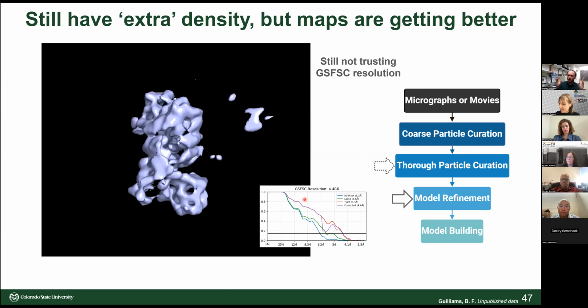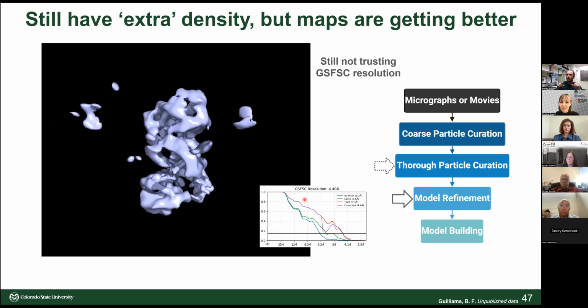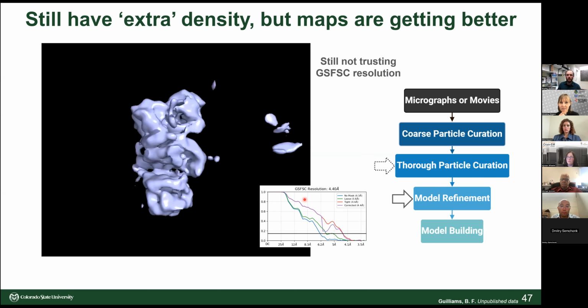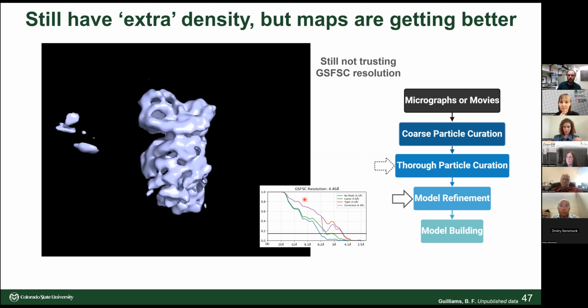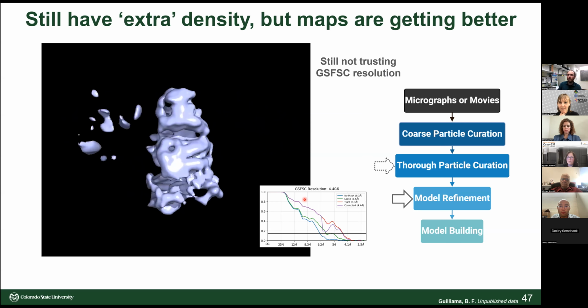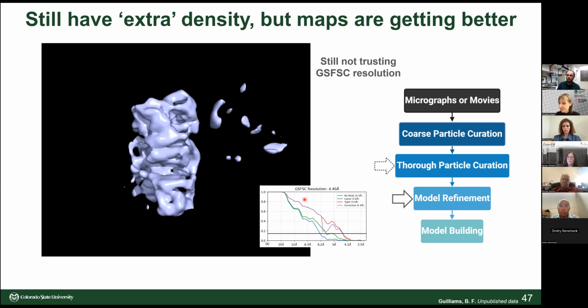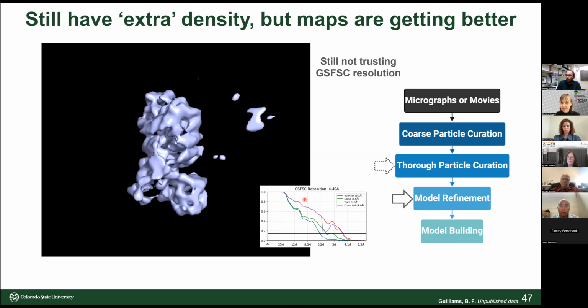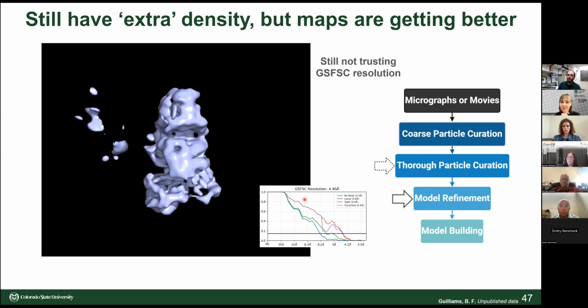I'd say the most textbook target audience for our tag is going to be proteins that you can't directly visualize, in an electron tomogram. So you're not necessarily going to be worried about shadowing because you wouldn't really be able to see the protein anyways. And so you're really just looking for the tag.